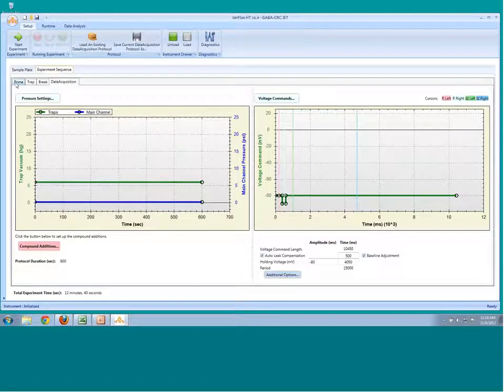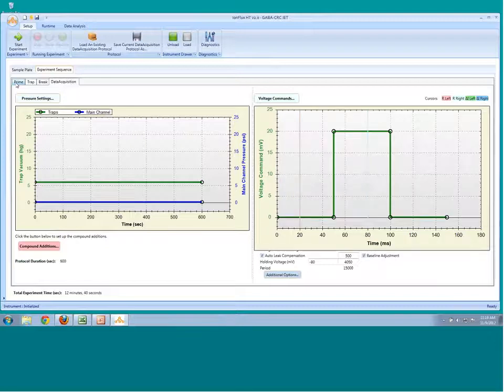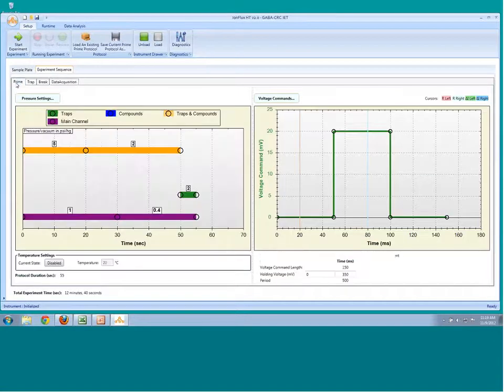Then within the experimental sequence now, my tiles are populated. And so we see during the priming phase now we have some information here. And so what is that information? And what we're defining, since we have microfluidic devices, are really the pressures that are being applied.